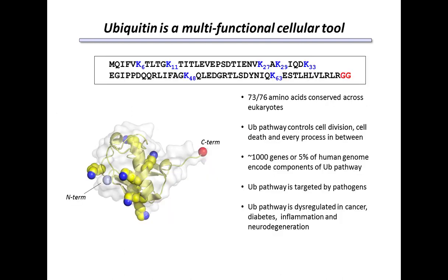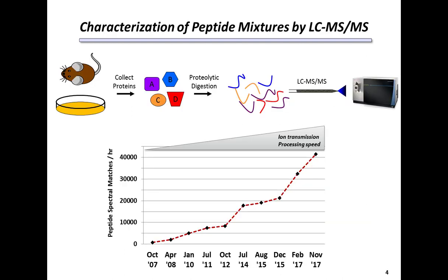One of the significant advances that's been driving this area of research over the last few years is an increase in our ability to identify and subsequently quantify these individual features or peptides. You can see just within our own group over the last 10 years, we've seen a full 50-fold increase in our ability to identify peptides by this mass spectrometry proteomics approach, owing largely to advances in 2 main areas: the efficiency of transmitting ions into the instrument and into the detectors, as well as the speed at which the instruments are able to process the ions, identify, and quantify the signals that come from them.